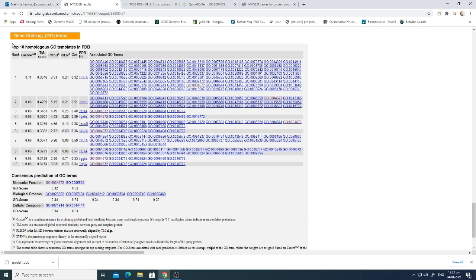I-TASSER is a good software to start predicting your unknown protein sequence if you were not able to find the right template using other homology modeling techniques. Thank you very much, I hope this is enough for today.